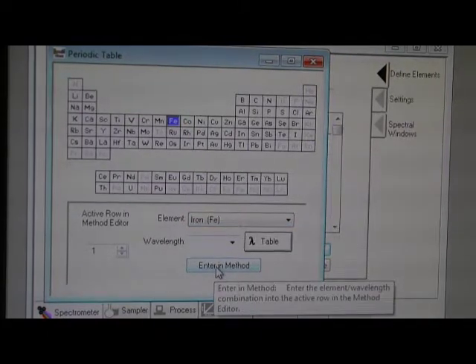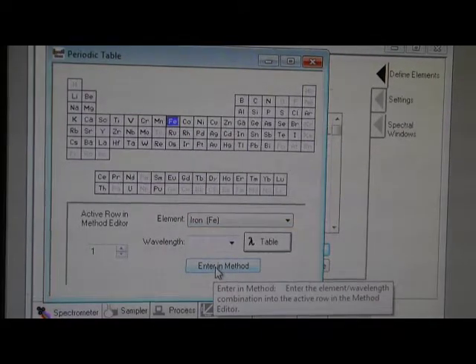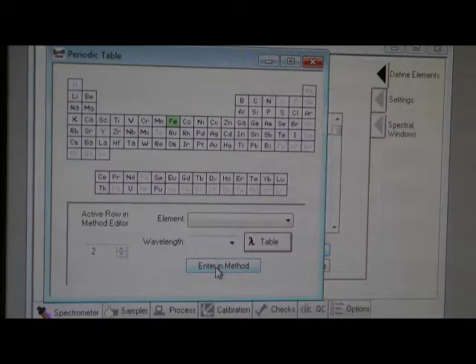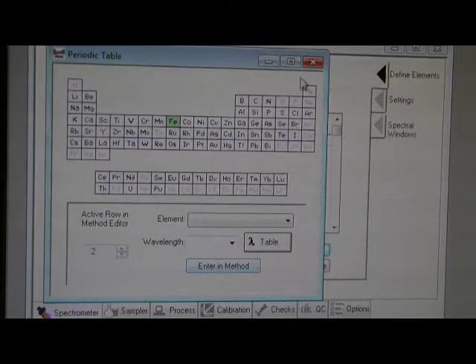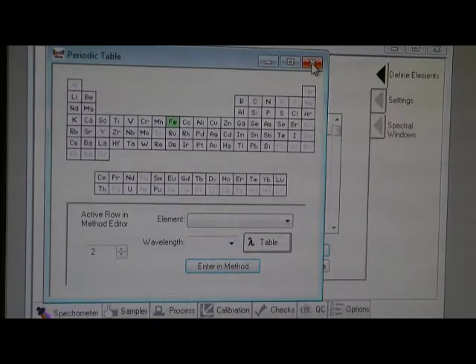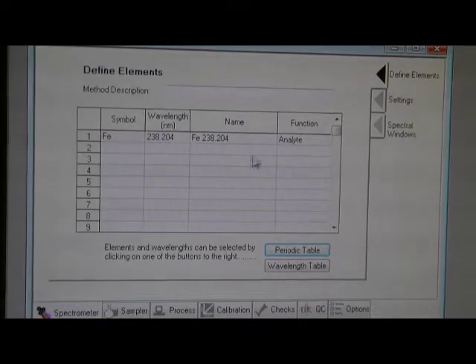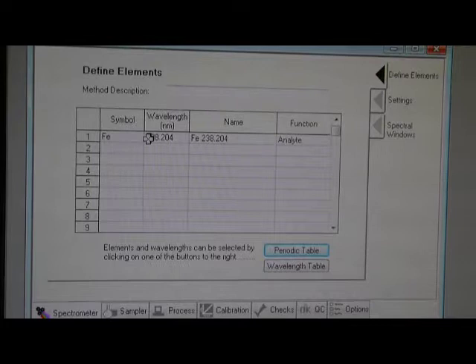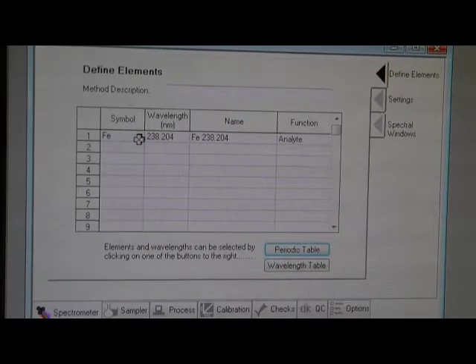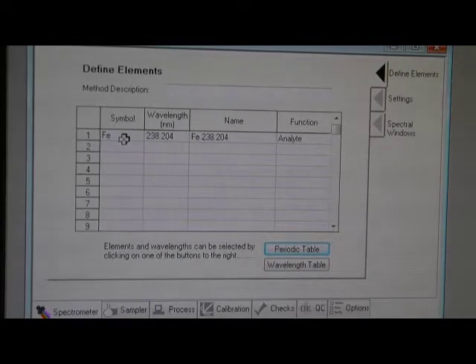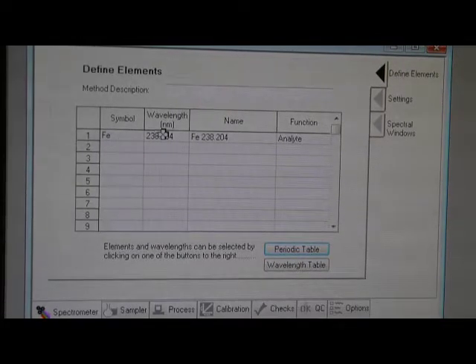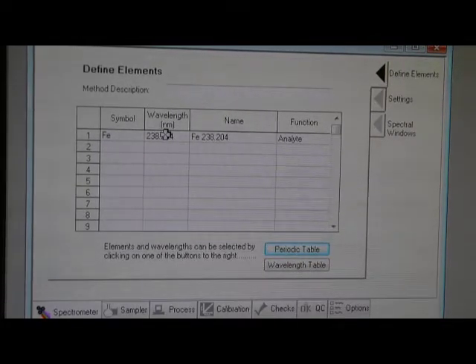And you enter and close and close. Now the symbol iron appears in the defined element.